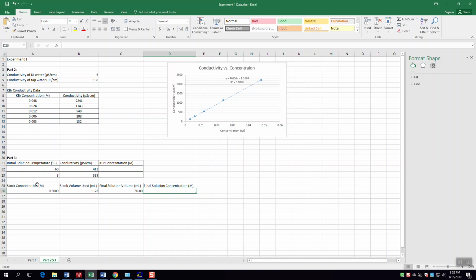Now, molarity is moles of solute over liters of solution. When water is heated up, its volume gets larger. So at 60 degrees, when you pour 60 degrees Celsius water in there, the volume is going to be larger. When you allow that to cool down to room temperature, it's actually going to shrink. The volume of water will become less. Since the volume of water becomes less and volume's on the bottom, the concentration goes up.